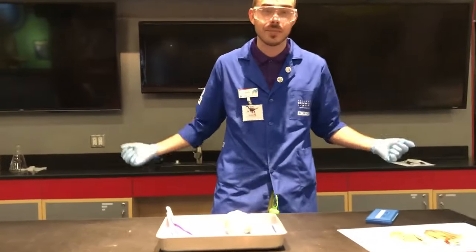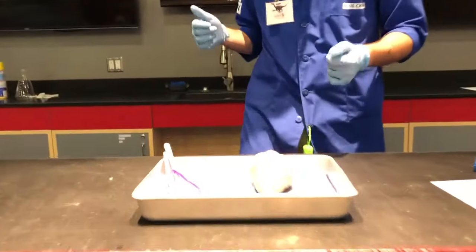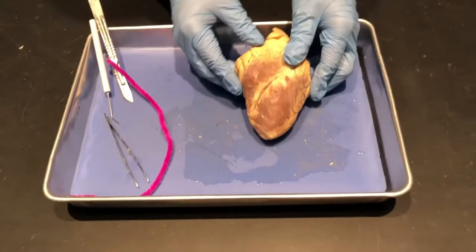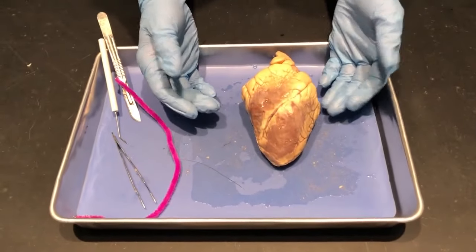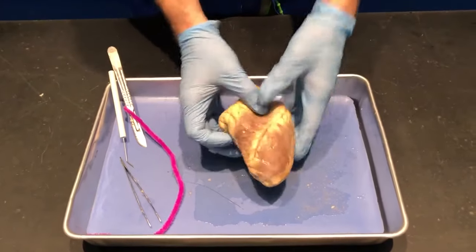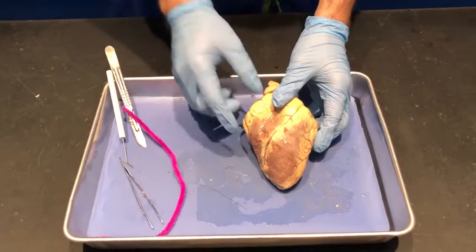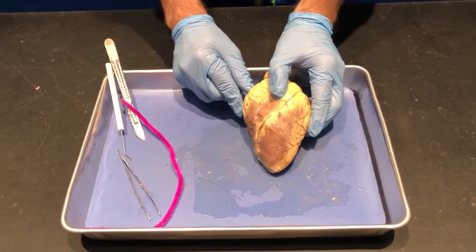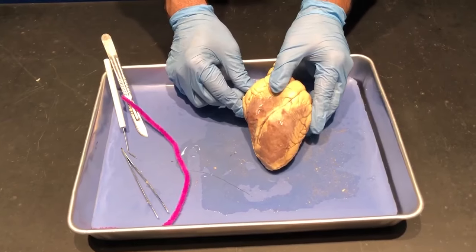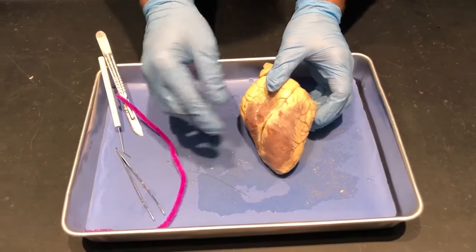We're going to have our amazing camera person Valerie come up and focus on the heart. So this is a sheep heart — it looks a lot like a human heart; human hearts are just a little bit bigger and not as slender. In the comments section of wherever you're seeing this, I want you to go ahead and write down your own observations or any cool facts you know about the human body or human heart along the way.